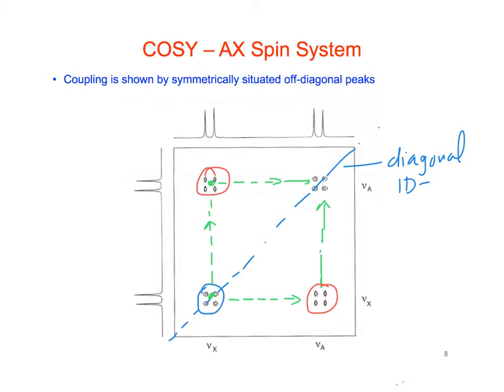Yeah. So I was just gonna ask another, so one of the ways that I've done it is, well, I'll do the same thing, but with the actual peaks themselves. So instead of going from the off diagonal to the diagonal, it would just go from the peaks down. Just start here, you mean, and look this way, and then this way? No, from the peaks themselves. Oh, yeah. That's the way I've done it. Would you prefer it if we did not do it that way?